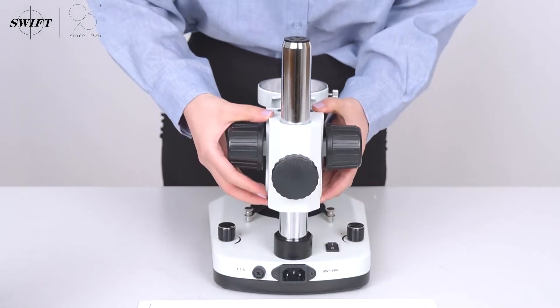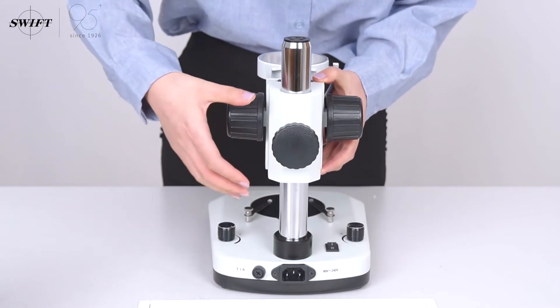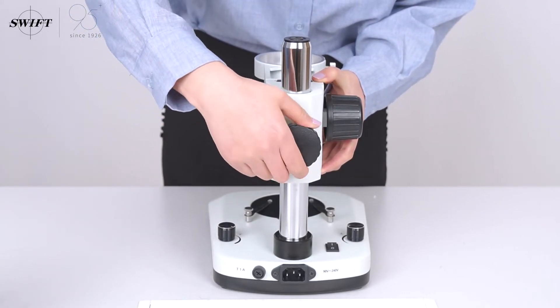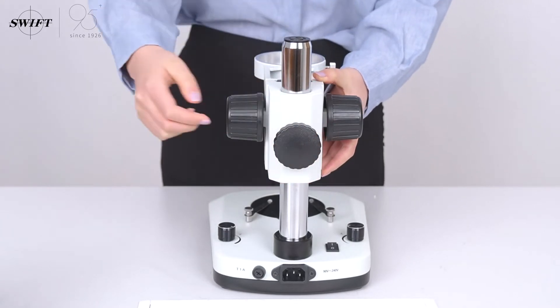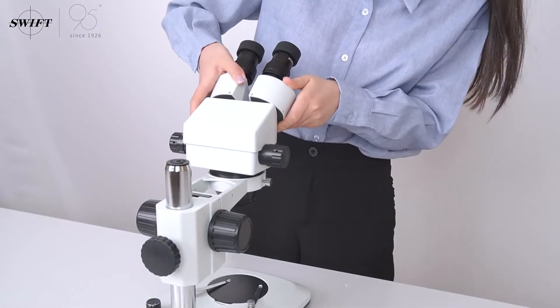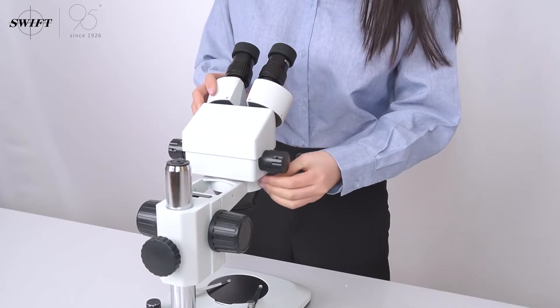Let's adjust the mirror body bracket to the appropriate height to quickly find the image by focusing. Tighten the finger tight handle to prevent the body from slipping off. Put the lens body into the bracket and tighten the screws.